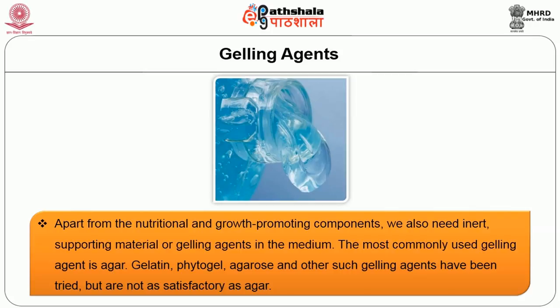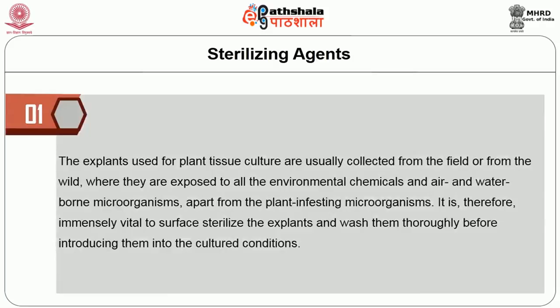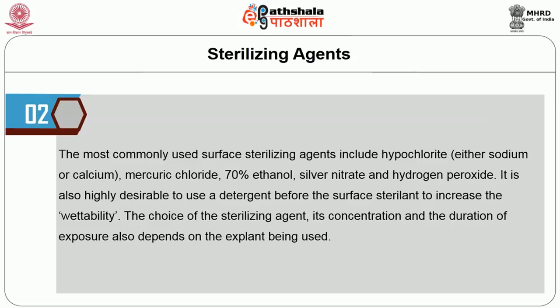Now, let us take up the sterilizing agents. The explants used for plant tissue culture are usually collected from the field or from the wild, where they are exposed to all the environmental chemicals and air and waterborne microorganisms apart from the plant infesting microorganisms. It is therefore immensely vital to surface sterilize the explants and wash them thoroughly before introducing them into the cultured conditions.